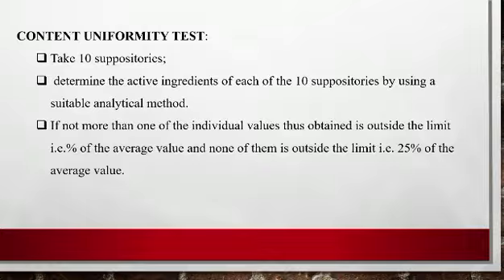First, we have to take these 10 suppositories. We check the active ingredient of each of the 10 suppositories by the suitable analytical method, and none should deviate by more than 25% of the average value.